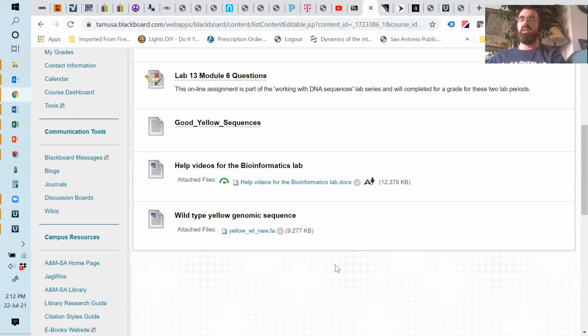So when you open Eugene, save it to your computer, same folder that you're doing all the other sequence analysis stuff in, and then try opening it from there using Eugene. Yeah, it may take a little bit longer, Robert. Again, don't worry about it too much. We have the freedom to do more of this next Tuesday. So keep watching. It's not going to hurt you when it comes to doing this for yourself, right? And then we can always go through it again on Tuesday as necessary if people need more time and more support.